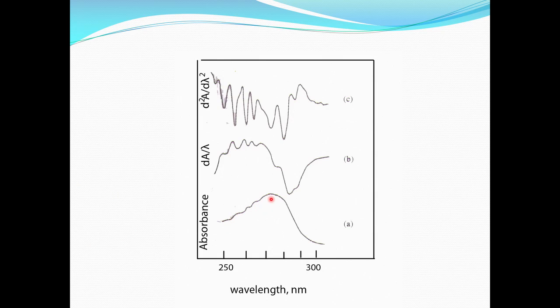Look here, I have a peak which is very vague, and it looks as if it has only one lambda max and the curve is not very well characterized, that is A. Now, look at dA by d lambda, absorbance first derivative, the same peak, how it is showing 1, 2, 3, 4, 5 and then one trough here and then lambda max extra.